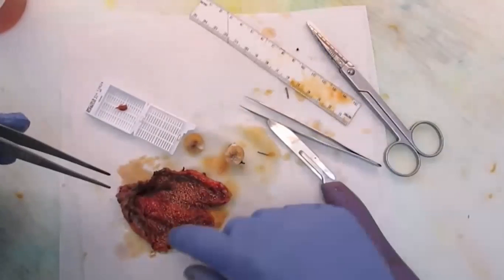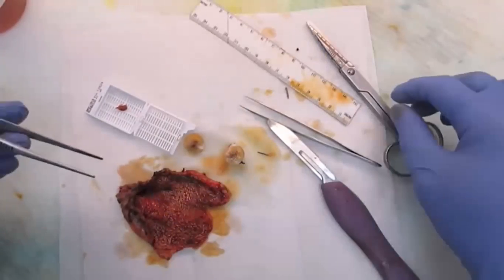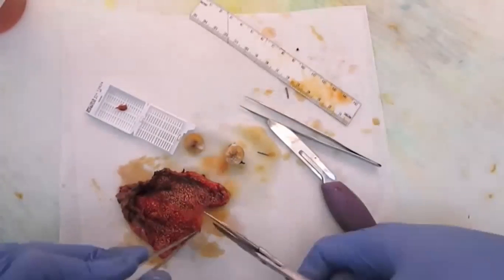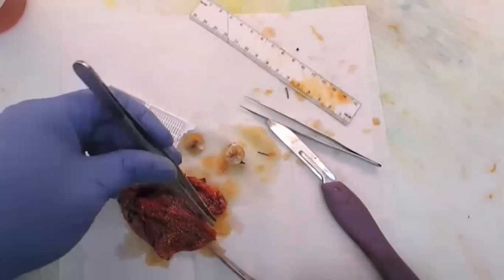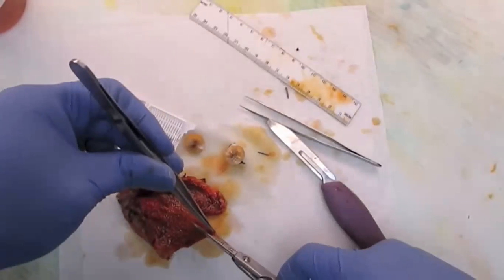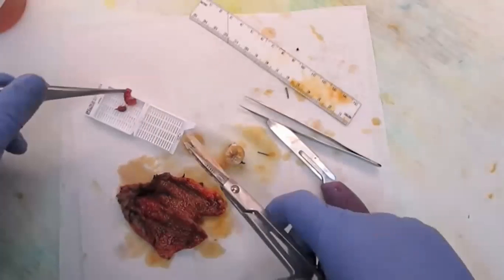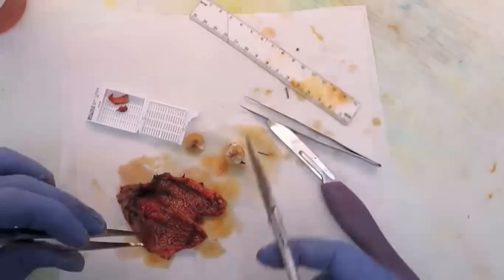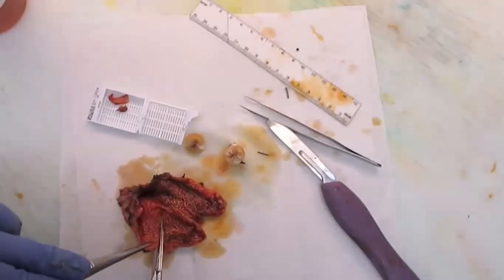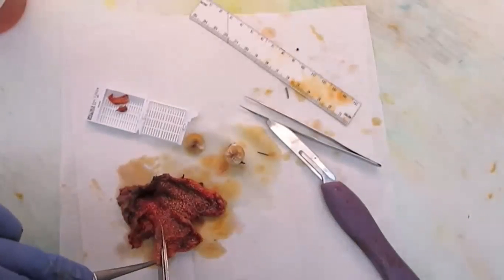So in this case, the basis is the presence of cholesterolosis. And since there's cholesterolosis everywhere, it doesn't matter where I sample from, I'm going to demonstrate that. But if there's cholesterolosis in only one area, then you're going to want to sample that area.